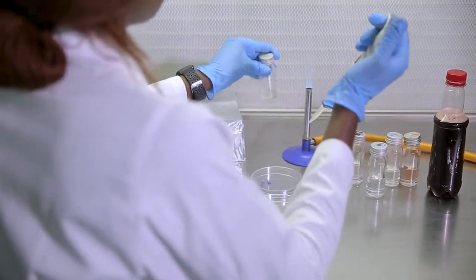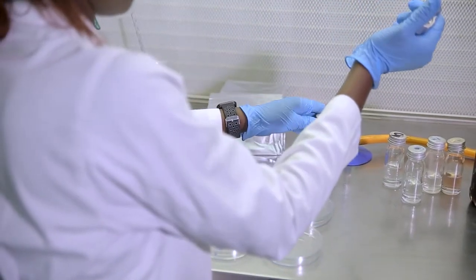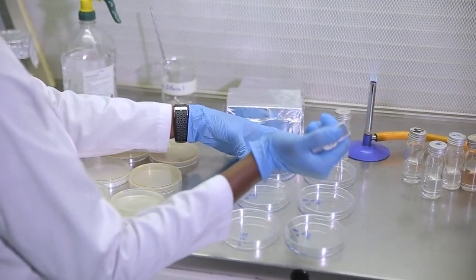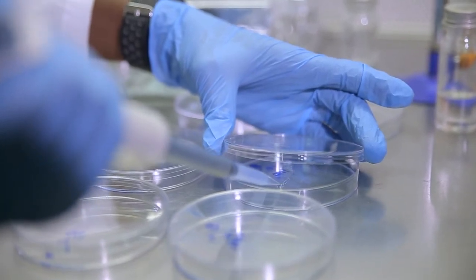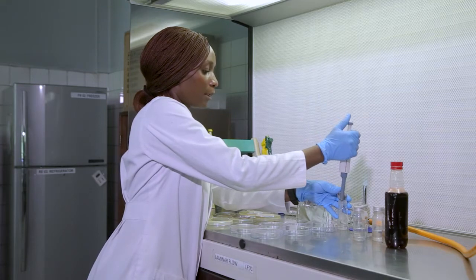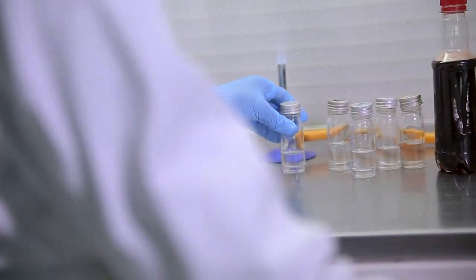So remember, this was the 10 to the power negative 5. Shake it a bit, okay? And then I'll pick 1 ml and put it on the plate that I labeled 10 to the power negative 5. You notice as I open the petri dish, it's just at an angle to prevent contamination. Deliver the 1 ml, okay? Since it's the same dilution, I can use the same pipette tip and deliver the inoculum, okay?